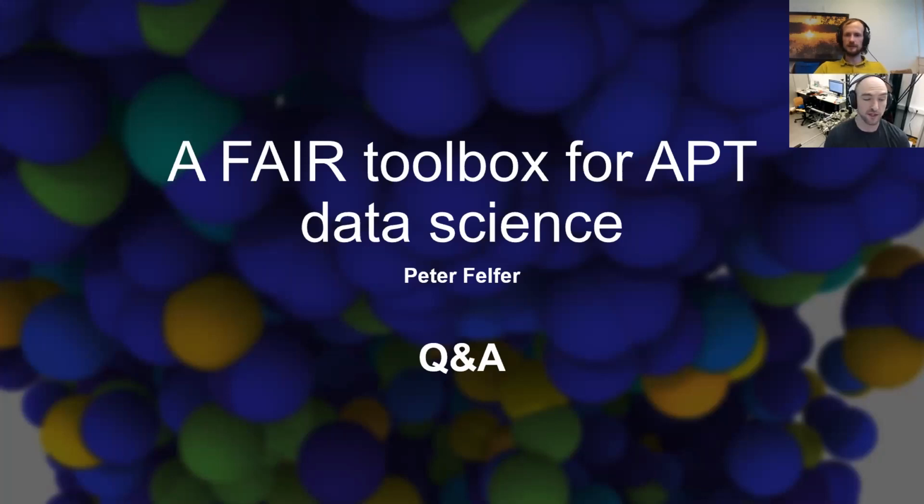And we also have very extensive code to do machine calibration, because we do have 2 Atom probes that we've built ourselves, apart from the commercial one that we operate. But this will only be included in the next release, probably early next year, because it's not as user-friendly as the other scripts in there.